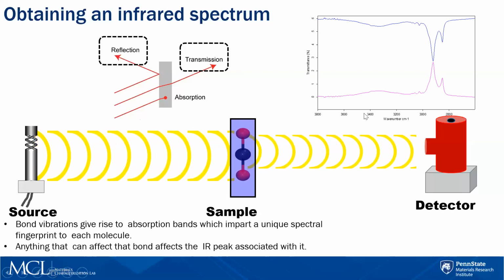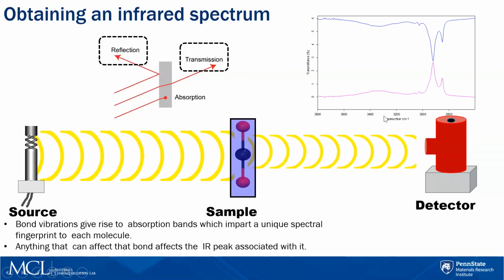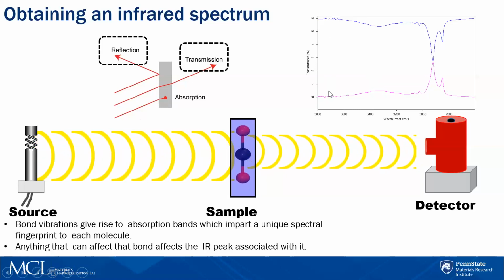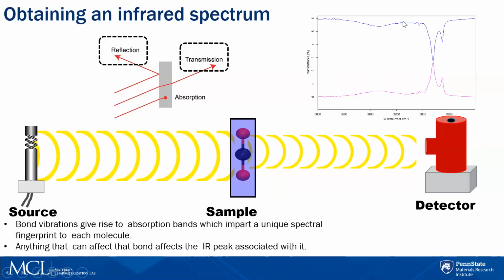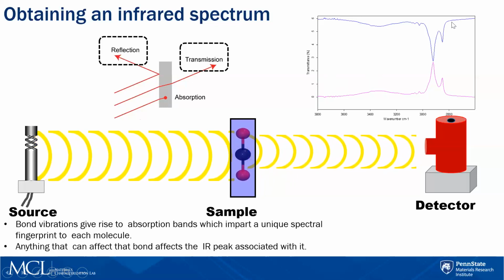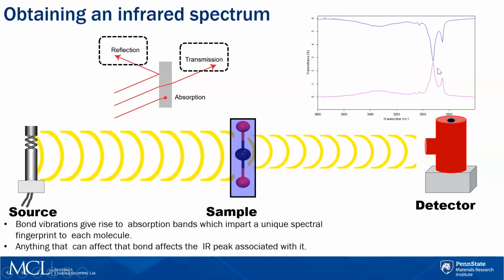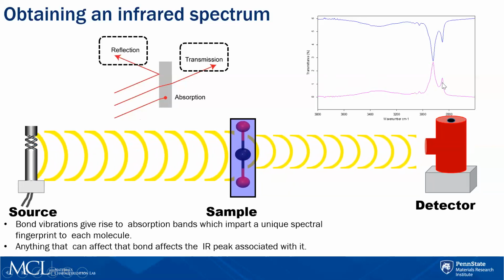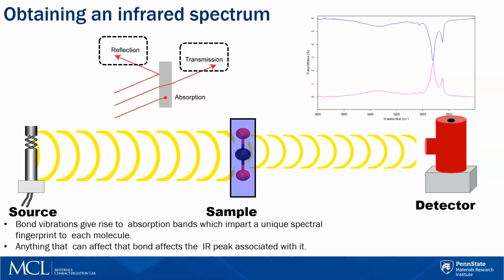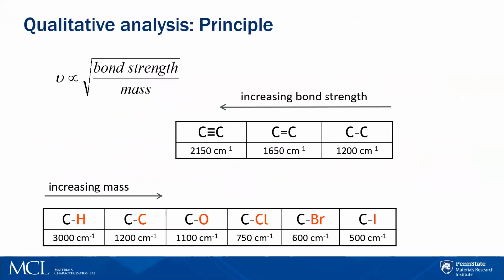Historically, in FTIR, data is presented as a plot with wave number on the x-axis with units of inverse centimeters. The y-axis could be transmittance, in which case we see dips where the sample absorbs IR radiation. The y-axis could also be in absorbance units, in which case we see peaks where the IR light is absorbed. Whether the y-axis is in transmittance or absorbance units is purely a matter of personal preference.